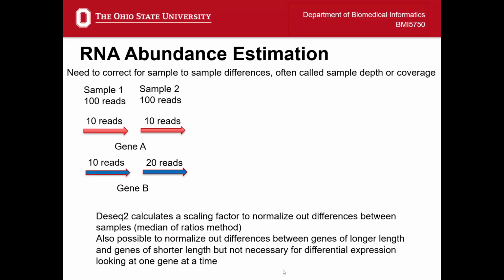Is it different from getting data from GEO? GEO is complicated because each listing in GEO can share the data in slightly different ways. You look at the GEO listing and there's usually a link you can click to download the counts table. Some GEO listings will only share normalized counts, and those will not be good for doing your differential expression analysis.